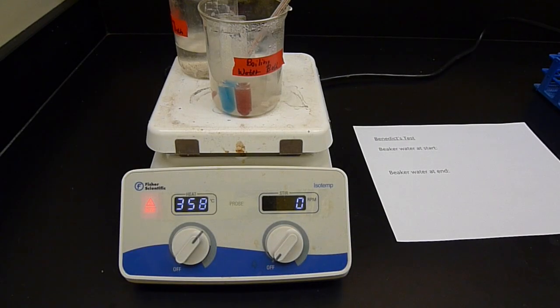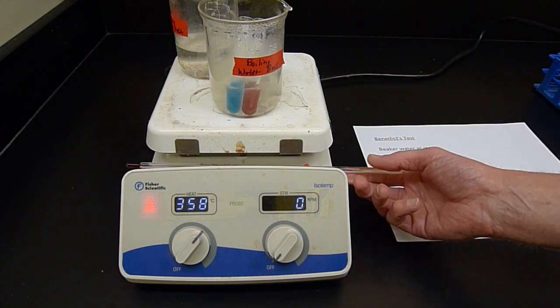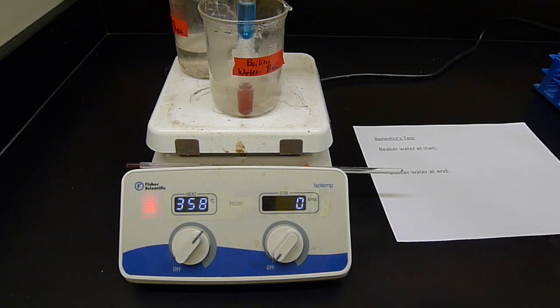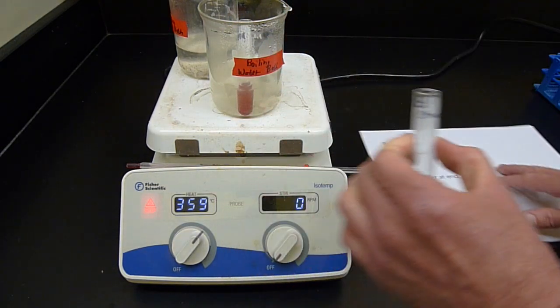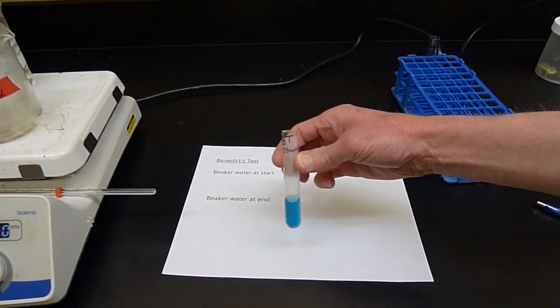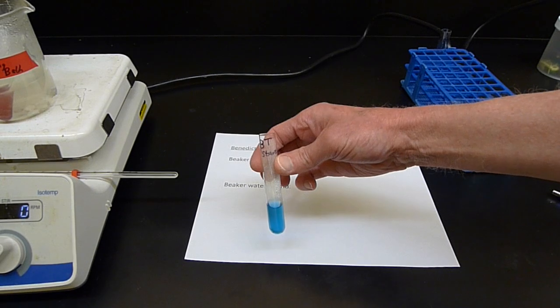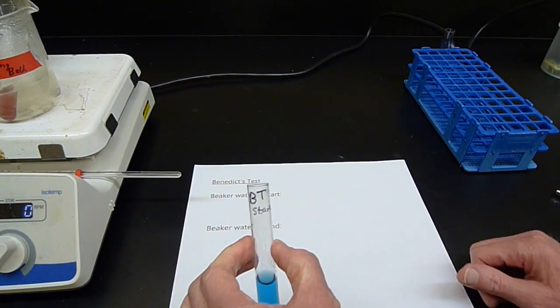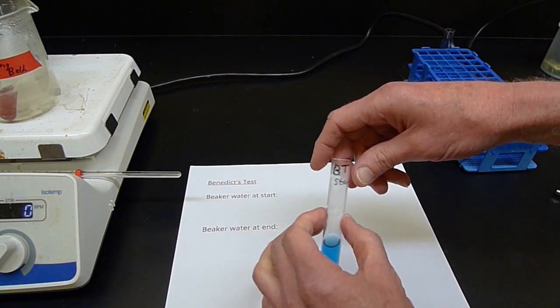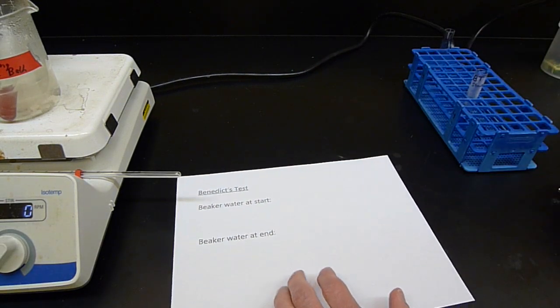So here we are after a few minutes of the Benedict's solutions cooking away in the boiling water. And notice they really do look different. Here is the tube with the beaker water at the very beginning of the incubation period for the diffusion. So this is Benedict's test at the start. Guess I should give you this view. Benedict's test at the start. And let's look at what it looks like. It's blue, right? It looks like Benedict's solution. So I'm just going to record this as light blue color.